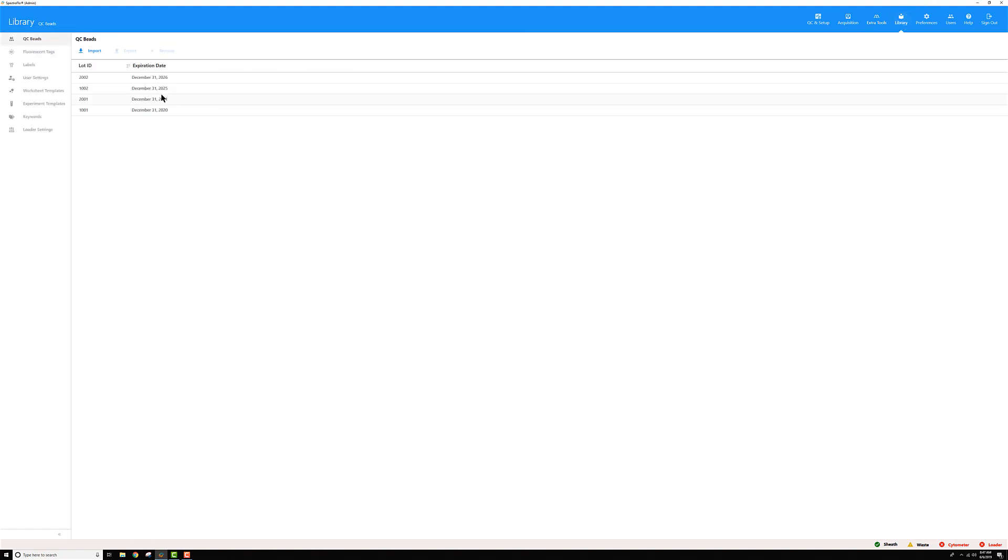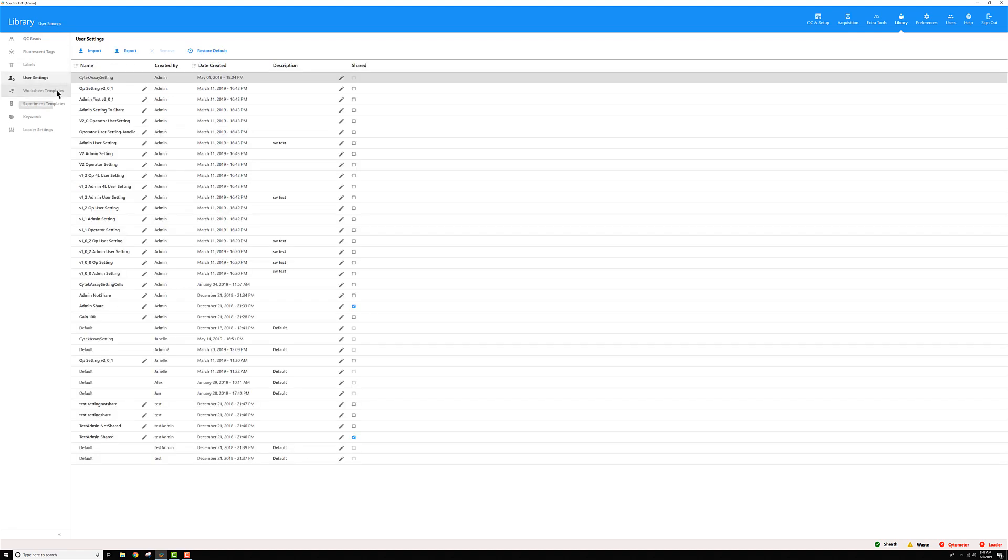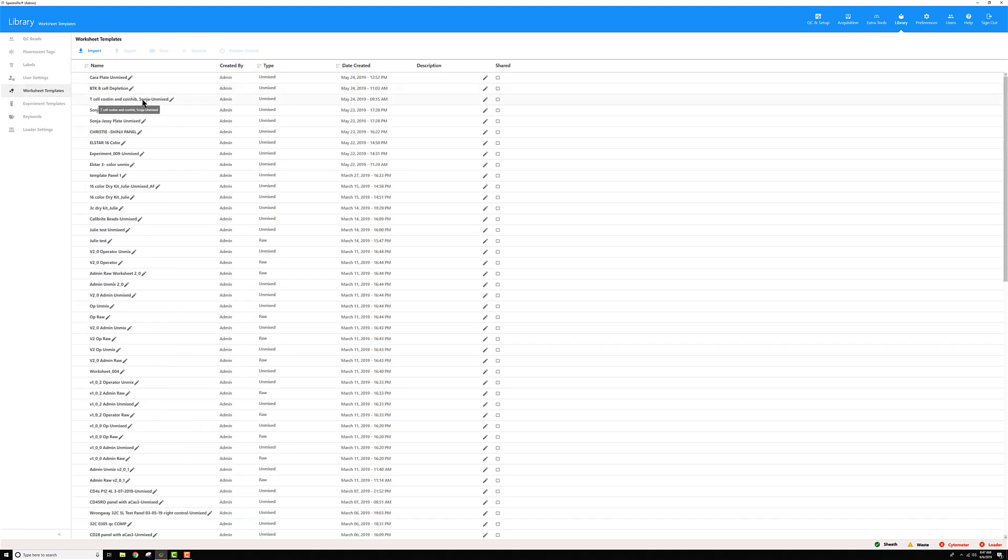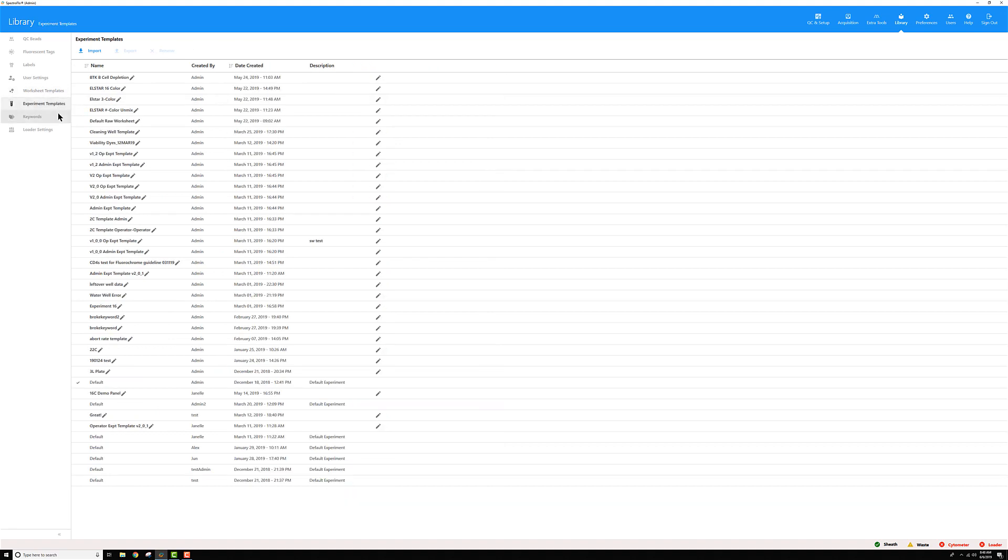Here's the library section, where you can see QC beads, fluorescent tags, labels for your tubes. You can work with user settings and import and export those. Maybe you have worksheet templates you want to export to another system, or import from another system. Same for experiment templates.